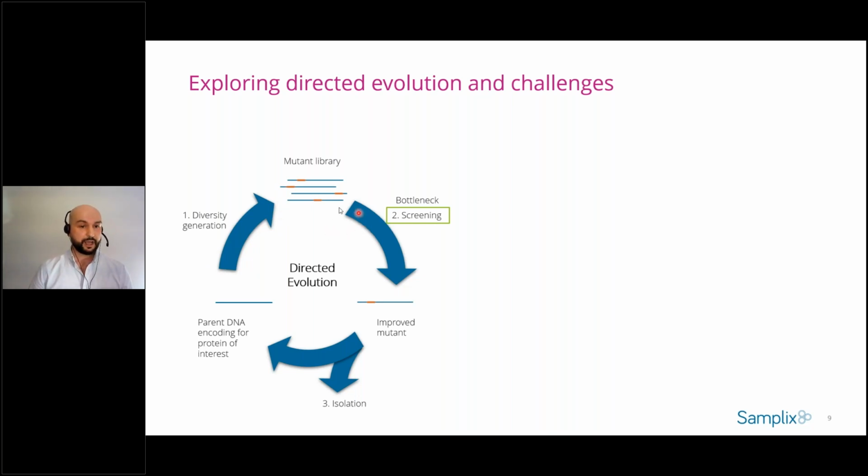Each mutant has different specific properties on protein level. So this DNA is then used to transform the host, and under application conditions, these libraries are screened. So the credo of directed evolution also is this: you get what you screen for. So if you want to find an enzyme that is thermostable, then your assay should reflect this condition.